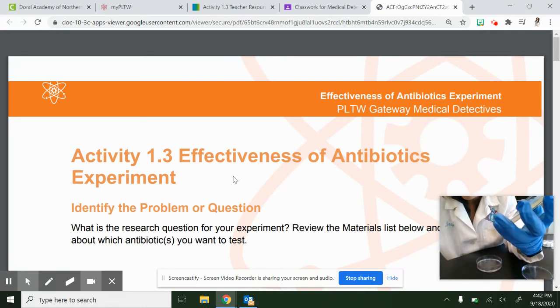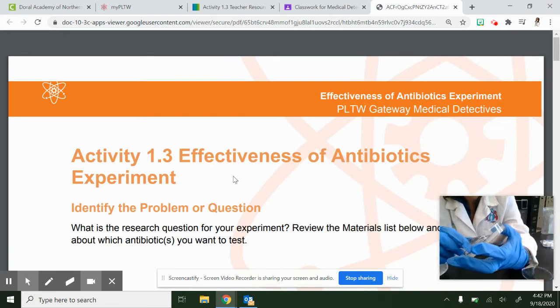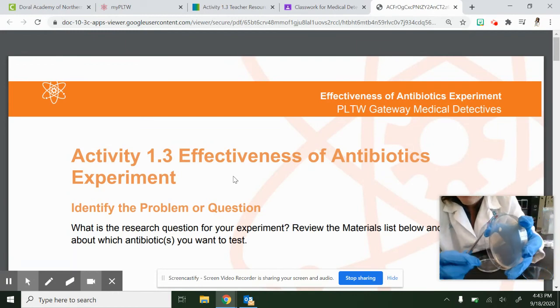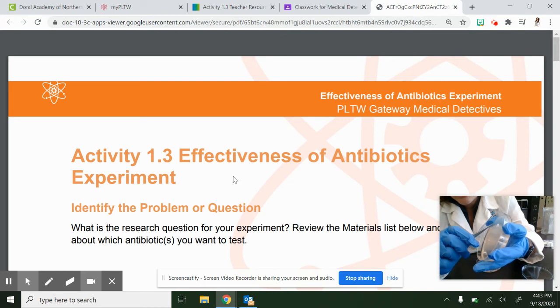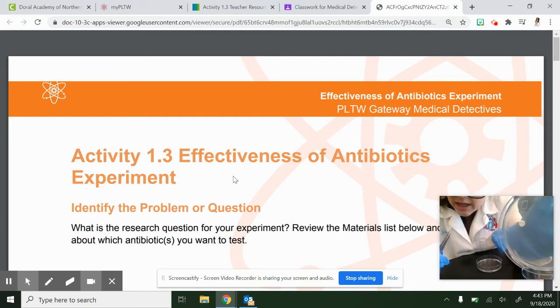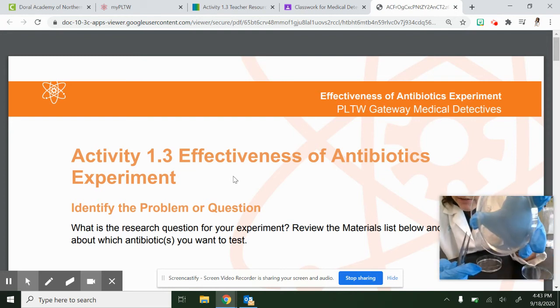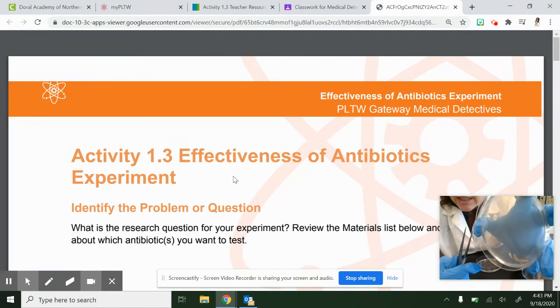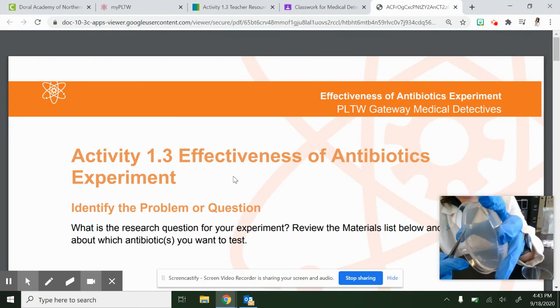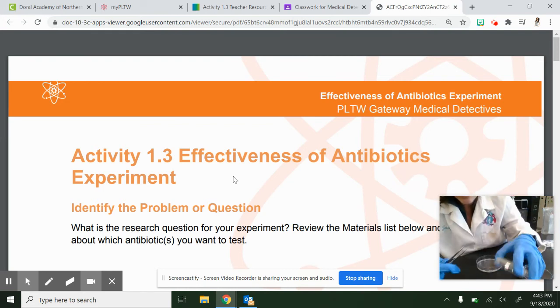Oh, dang it. Good thing there's not actually bacteria in here. So maybe don't try to talk and videotape this at the same time. You want to push it down in there, kind of good, because you really want that agar really around it, okay? You don't want to be flinging this thing around, because inside of your Petri dish, I didn't actually put any into this, it just was showing you, is going to have your E. coli bacteria. So take that antibiotic disc or discs and shove it down into there as quickly as possible, sort of spreading them out.